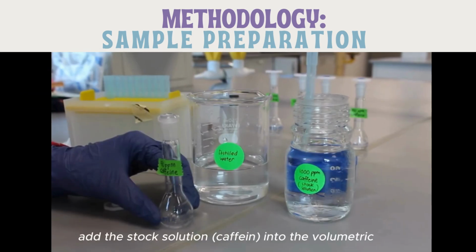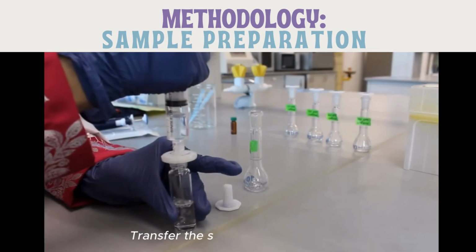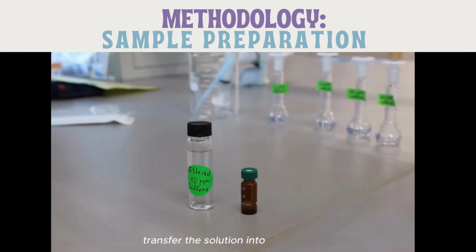First thing first, we will add the stock solution, which is caffeine, into the volumetric flask and refill it with distilled water until it reaches the mark. Then, seal the volumetric flask and mix the solution well until it's homogeneous. Transfer the solution into the syringe that is attached with the filter and the solution was filtered into the glass tube. After that, from the glass tube, the solution was transferred again into the HPLC tube like this.